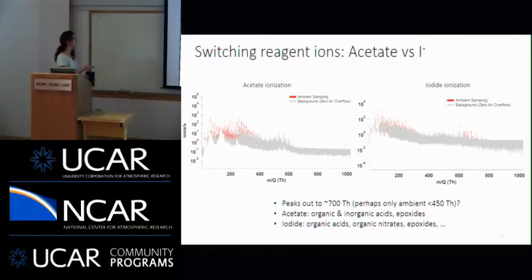But then you still see the red, which is the actual measurement in this case. And you still see a huge number of peaks. So there are a lot of molecules in the atmosphere. That's what we get out of these figures. Lots and lots of different molecules. Here again in I-, we still see above background some of these really high molecular weight compounds, but we don't really think they're real because the background does shift a little bit. So background is a really big issue in these measurements.